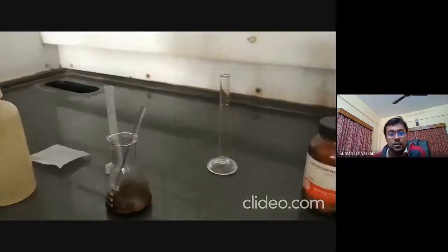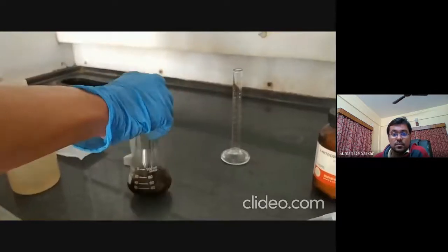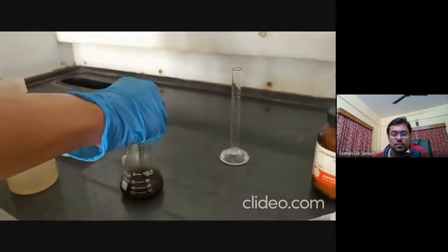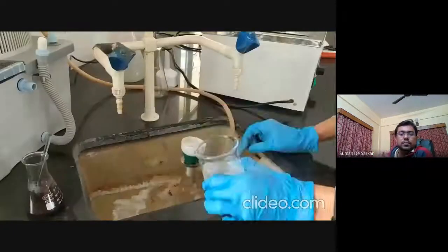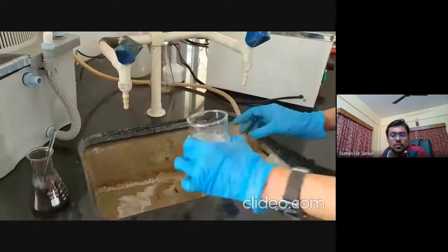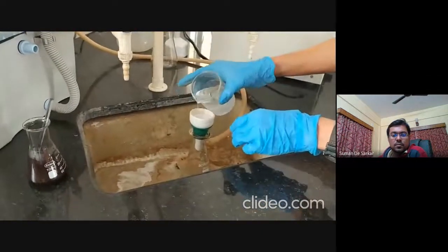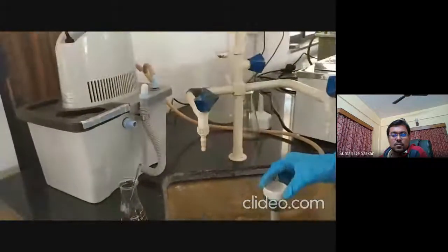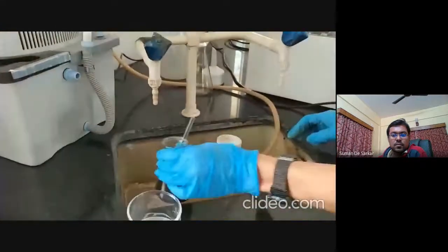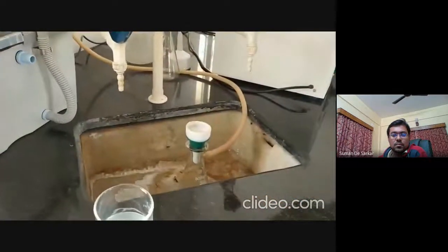Let it stand for 5 minutes, and then we will go for filtration to collect the indigo. If you have a dilute solution, then you'll see it's blue. After 5 minutes we are filtering off the indigo. First we prepare the Buchner funnel for filtering. This is the aspirator, and there is a pump inside. So this is the Buchner funnel.